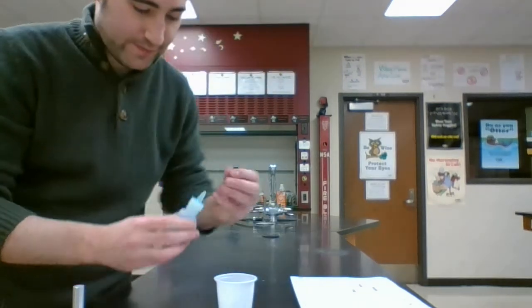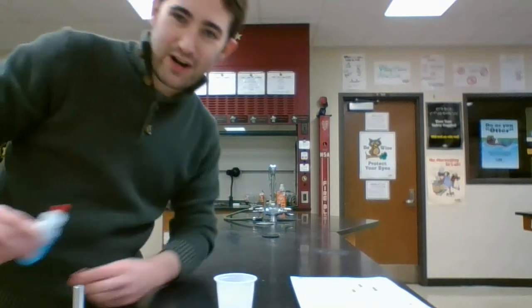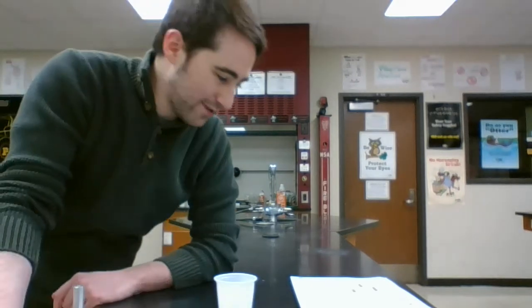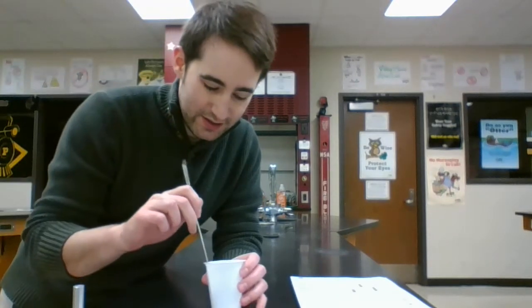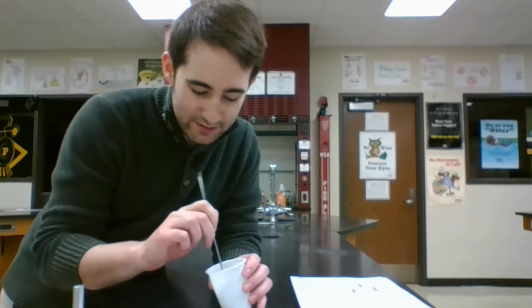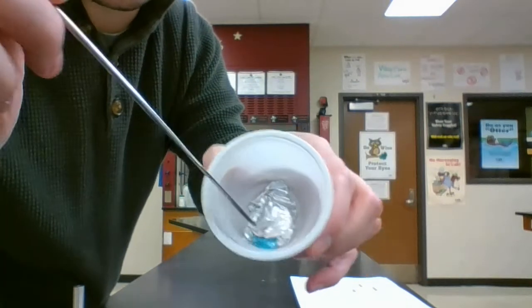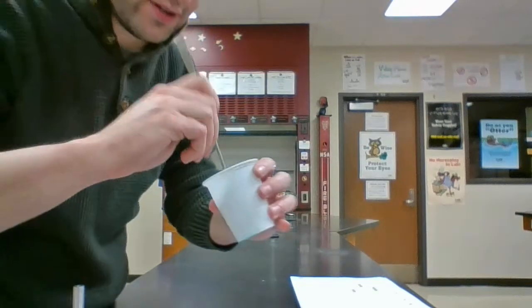Looks about good. We're going to try and figure out what kind of change is going on here and what gives it away. To get this going, I have to scrape at it a little bit. You can see there's that blue liquid in there, and I'm just going to scrunch it in there.